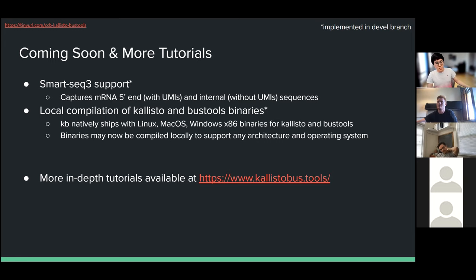first of all, Cell Ranger uses STAR internally, and it's just a regular aligner. If you're interested in the exact mutations that happen, I don't think Kallisto bustools is a tool to use in its current state until we figure out how to do that, which we're actively working on. But in terms of just regular cell type profiling, I personally always use Kallisto bustools. Once I figured out how to use it, I never looked back at Cell Ranger.